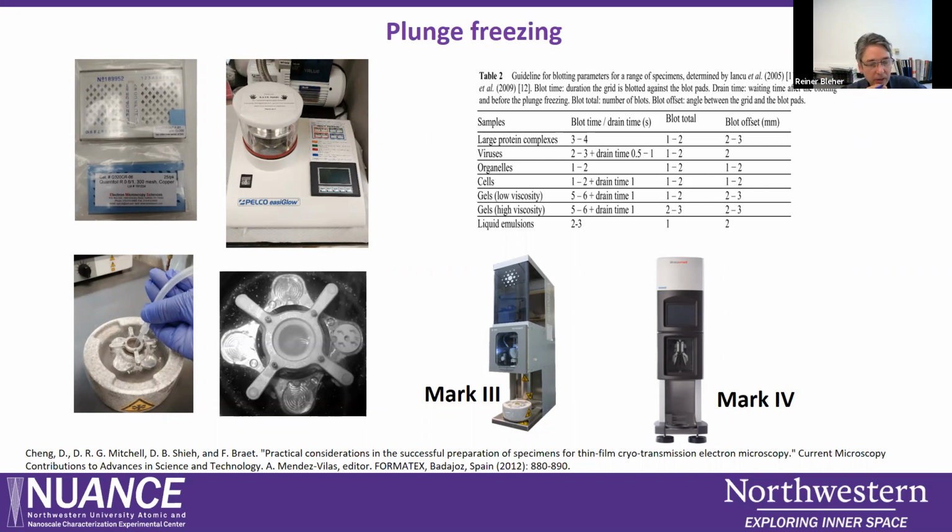Also, usually grids are pre-treated with plasma to make them hydrophilic before samples are applied. And it is also advised that the ethane should be as cold as possible for freezing a sample, and this is indicated by the presence of frozen ethane around the inner perimeter of the ethane cup, which is shown in the picture you can see here. So this is the frozen ethane.